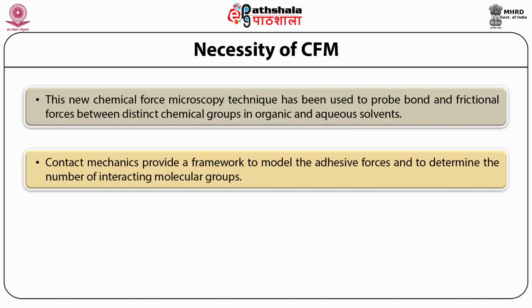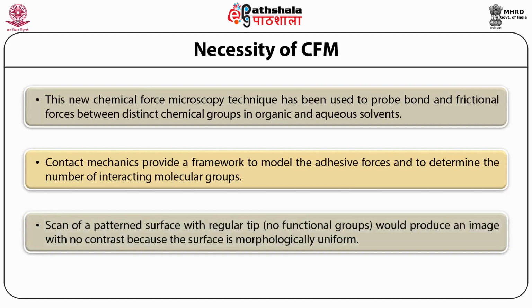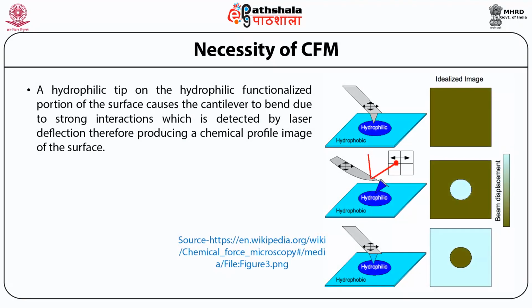Contact mechanics provide a framework to model the adhesive forces and to determine the number of interacting molecular groups. A scan of a patterned surface with a regular tip, where no functional group is present, would produce an image with no contrast because the surface is morphologically uniform. A hydrophilic tip on the hydrophilic functionalized portion of the surface causes the cantilever to bend due to a strong interaction, which is detected by the laser deflection, therefore producing a chemical profile image of the surface.